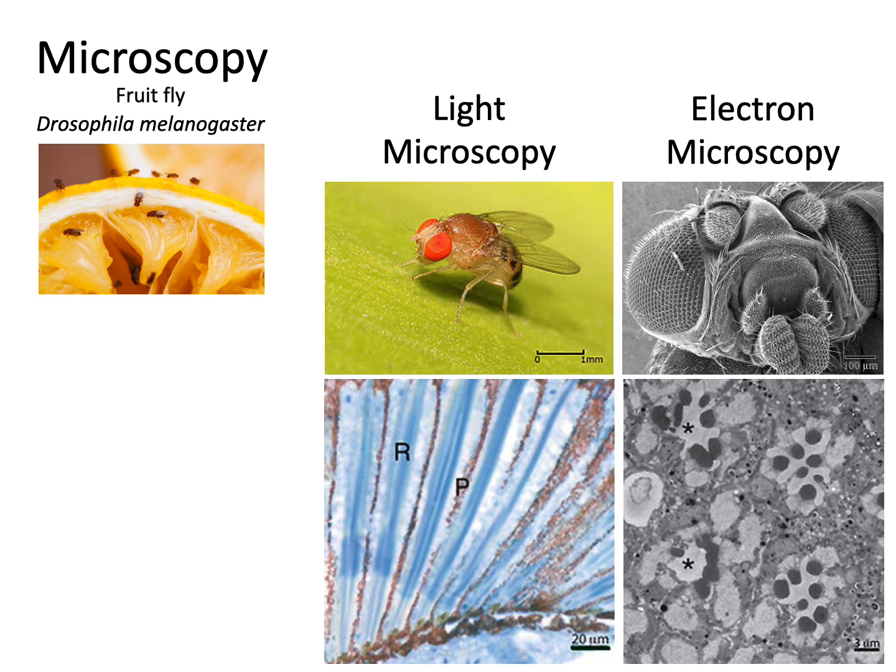And to summarize and just look at it all together, these are the different types of microscopy. So we looked at how you can bring to light things that are not normally resolvable with the unaided eye. With light microscopy and electron microscopy, both of those approaches that we see there on top are bringing down some sort of particles, photons or electrons, from the top, and then visualizing the way they bounce off of or interact with your sample. Whereas on the bottom two panels, it's either light or electrons passing through your sample.